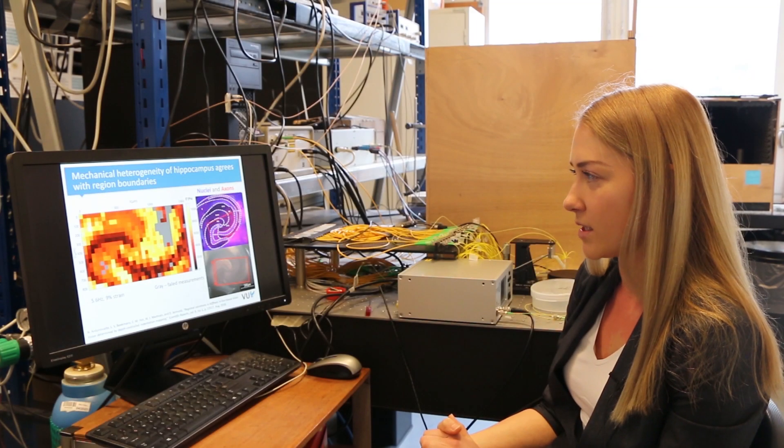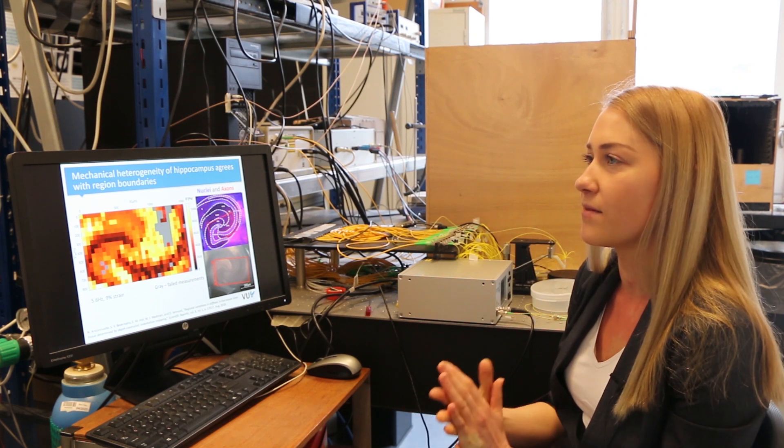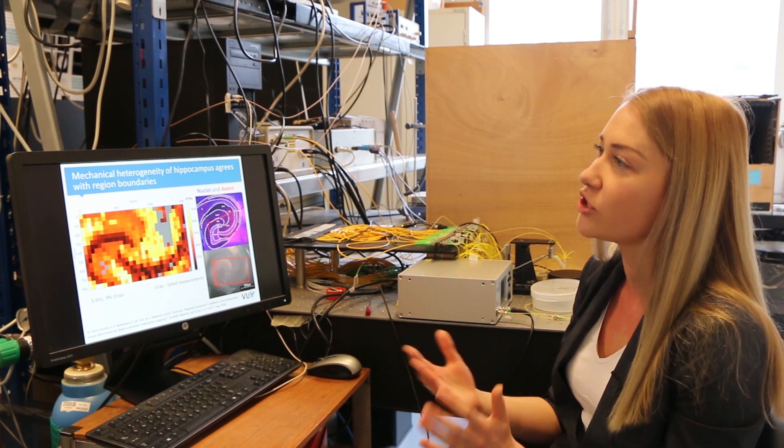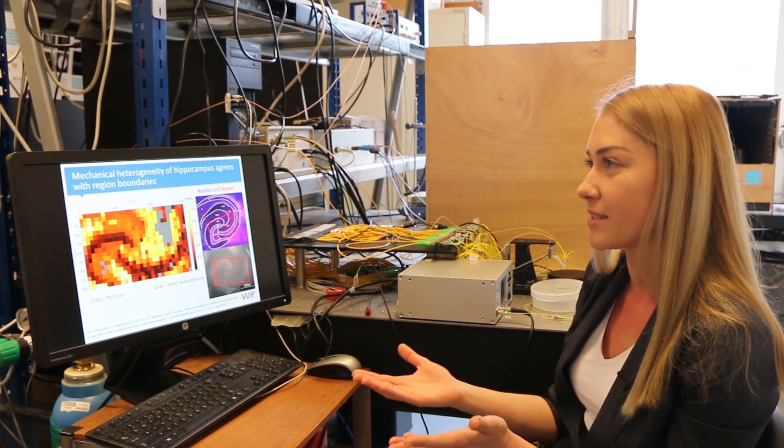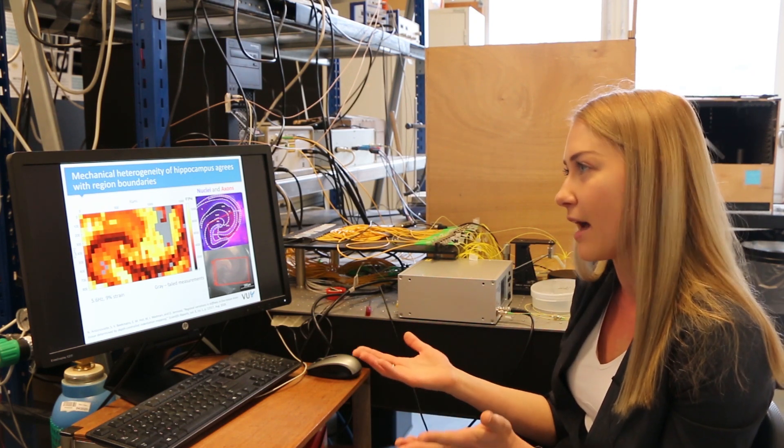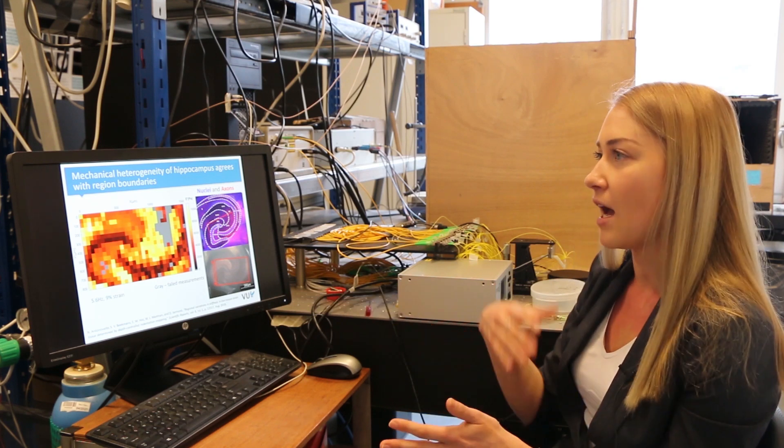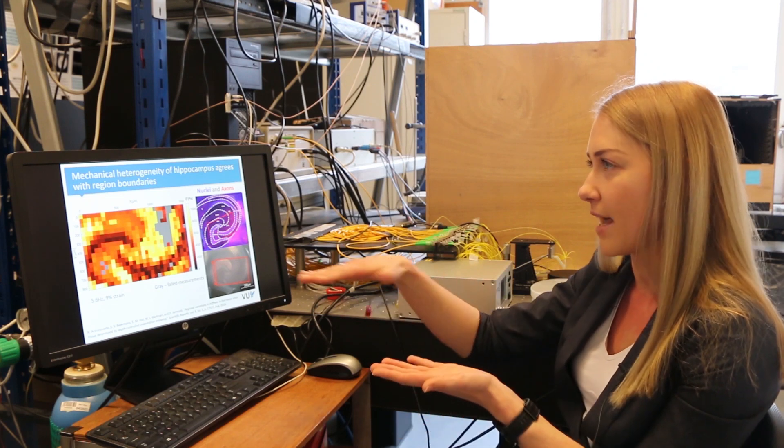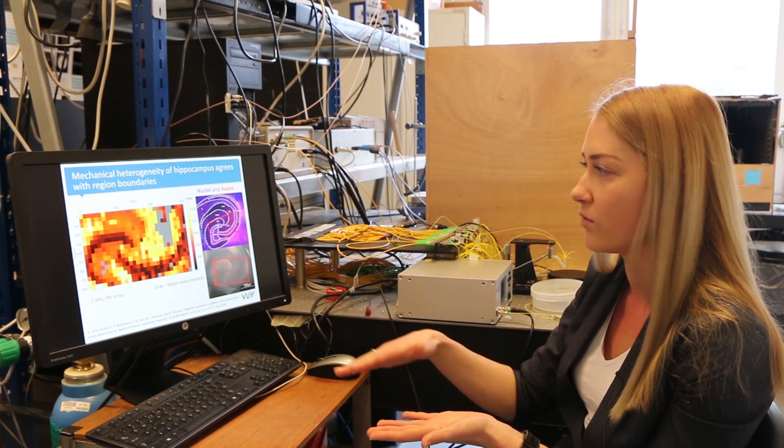So the difficulty was, first of all, having your sample alive. So we joined the neuroscience groups to collaborate with them where they do electrophysiology. And then they showed us the way to prepare the sample in order to keep it alive for like six hours. So how to slice it, how to perfuse it so it stays alive and it's flat so we can really measure over it.